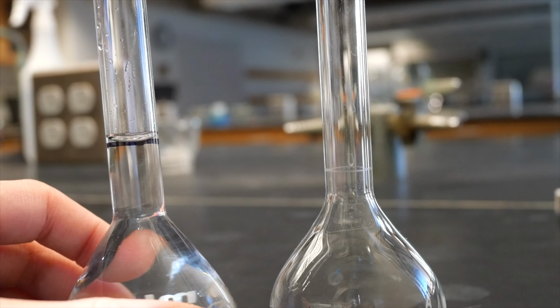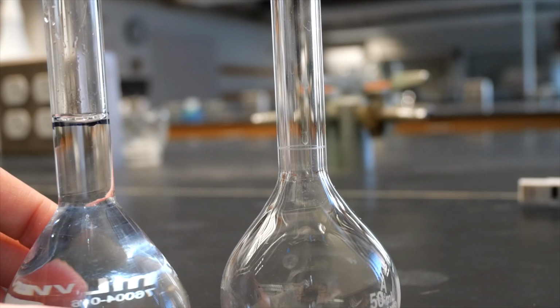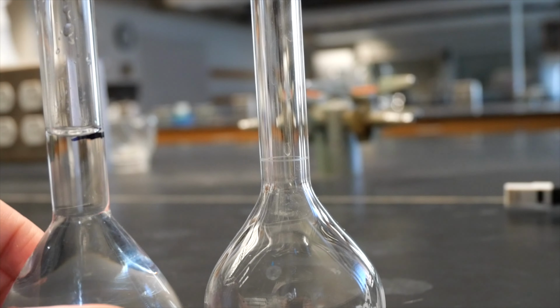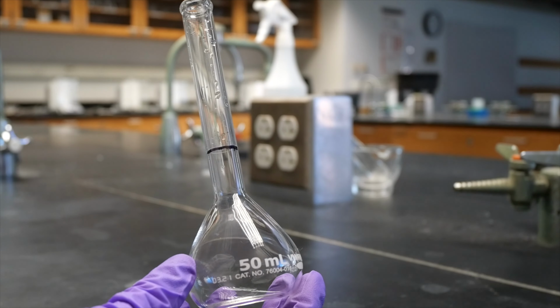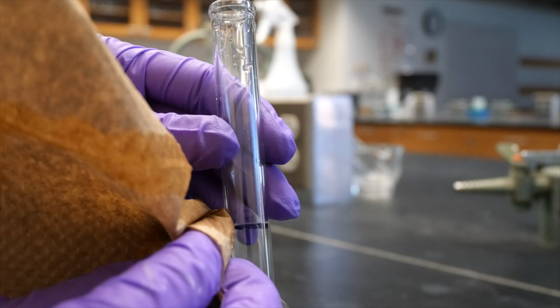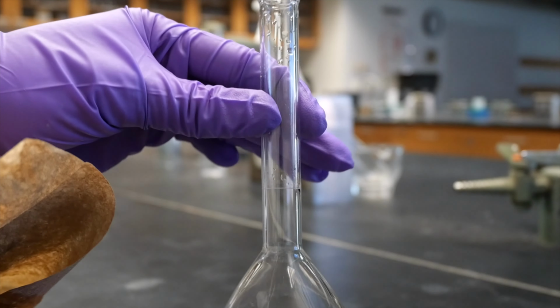You could also use a burette reading card, which is a white card with a black horizontal rectangle, and you can use that to make the meniscus easier to see. And when you're done, you can just spray ethanol on a paper towel and wipe off any black marker that you used on glassware.